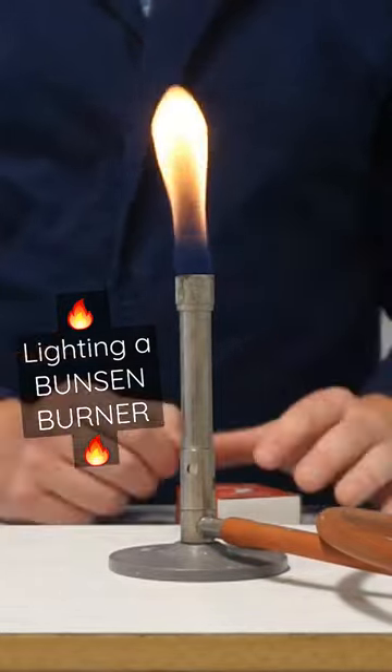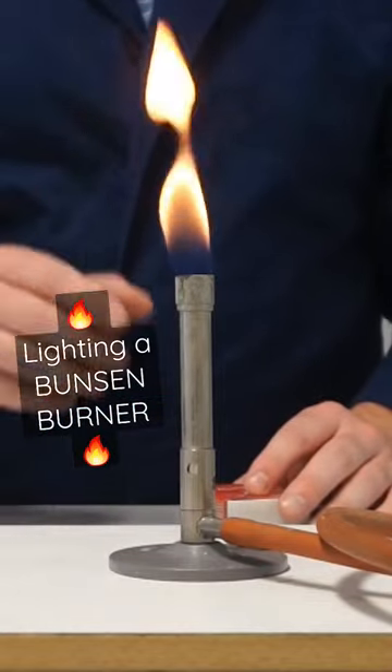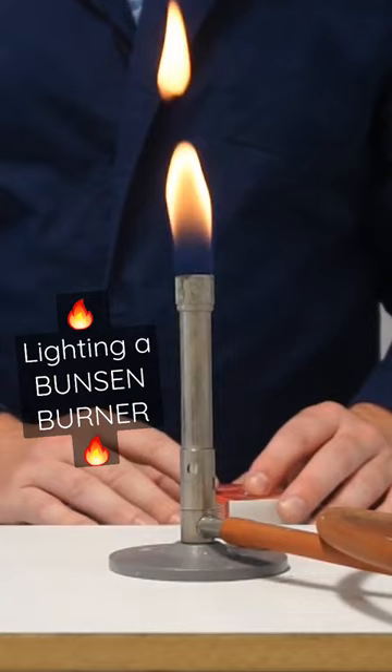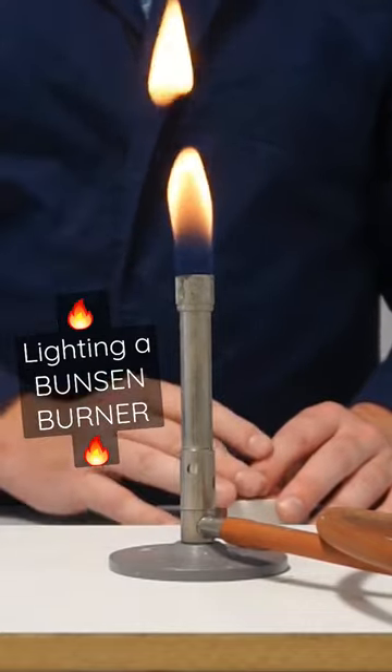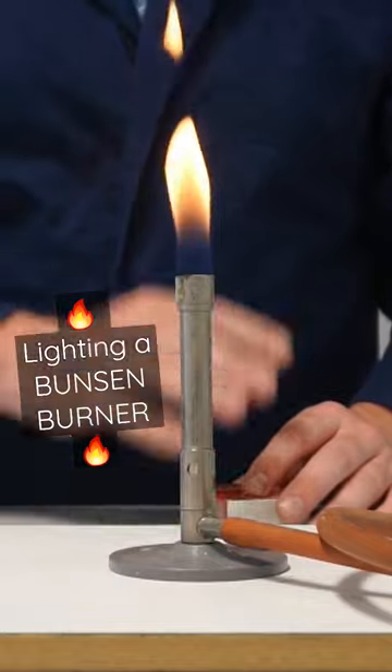The flame should be yellow, and this is our safety flame. It's less hot than the alternative flame that I'll show you, but this is used when we're lighting the Bunsen burner, and also if we have to leave the Bunsen burner unattended.